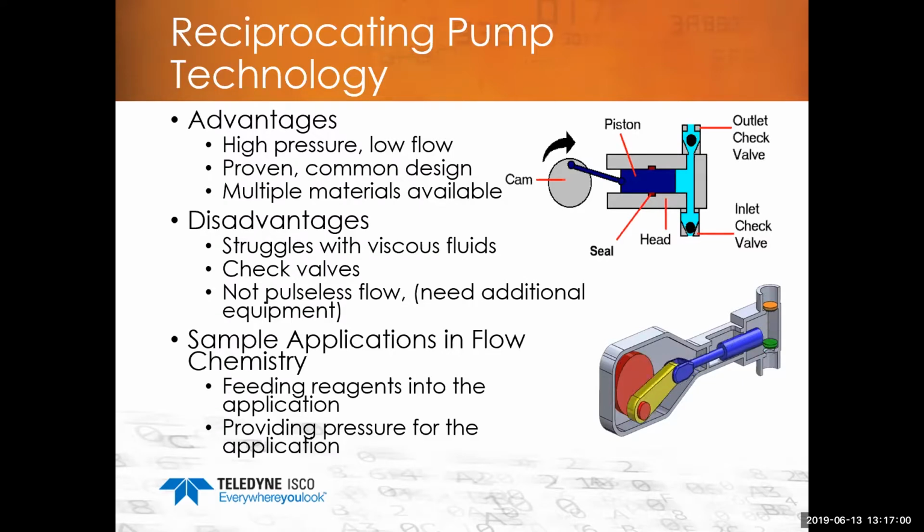Again, applications here are just feeding the reagents in the application, and some pumps, like the Raxis series we have here at Teledyne ISCO, can just provide the pressure. It doesn't provide constant flow, it's a constant pressure mode. So if you just need to pressurize the lines to move the material through, you can use the device for that. Keep that in mind when you're thinking about how you're designing your application.